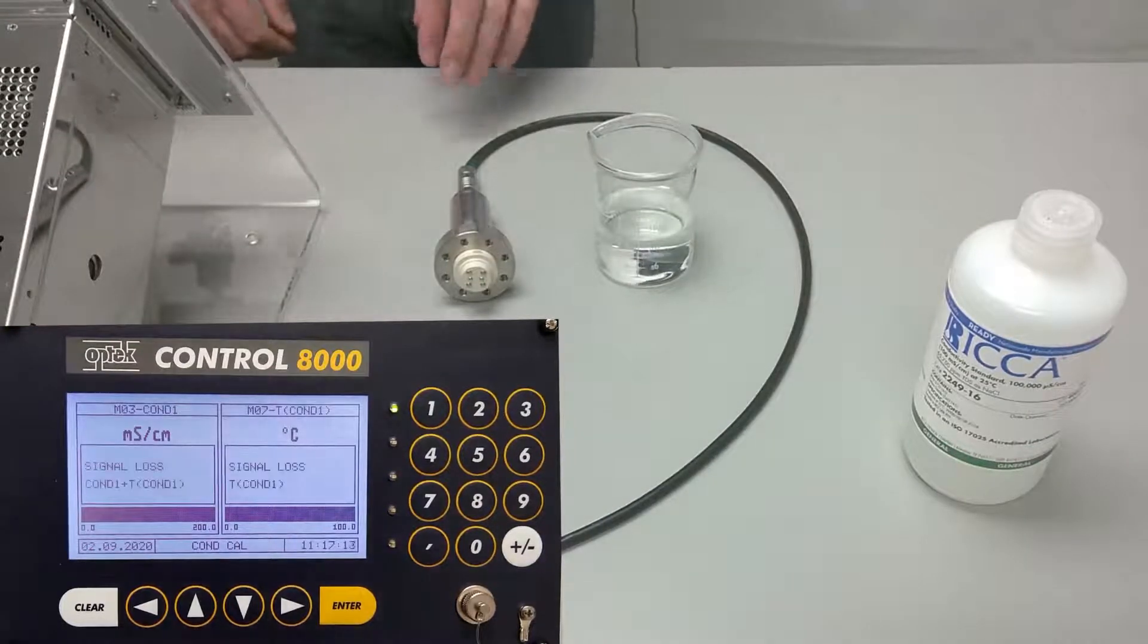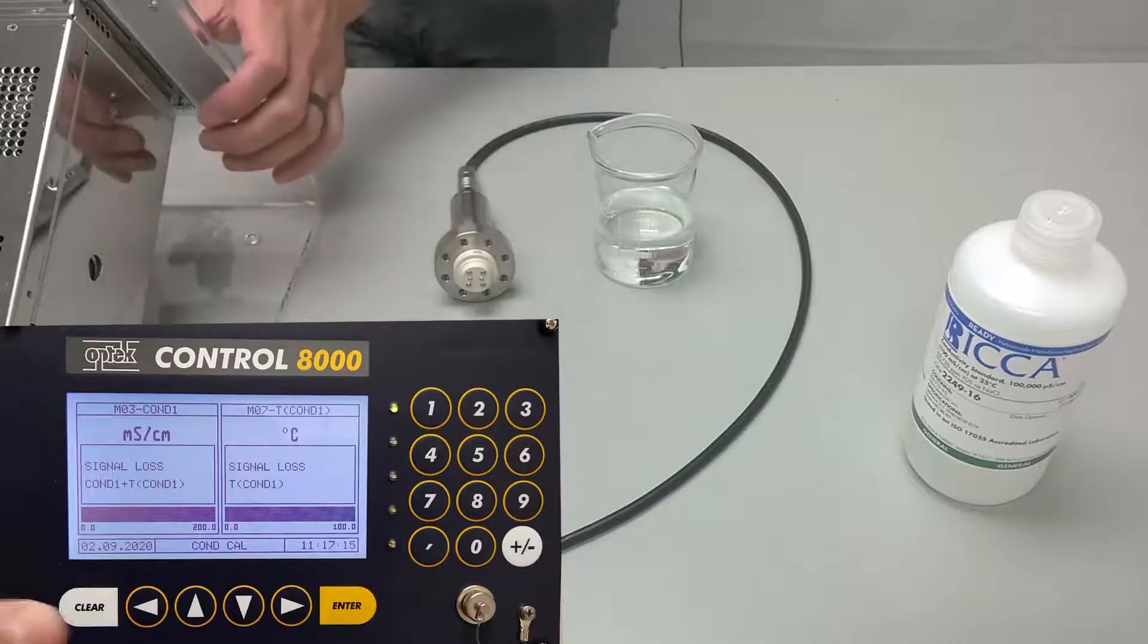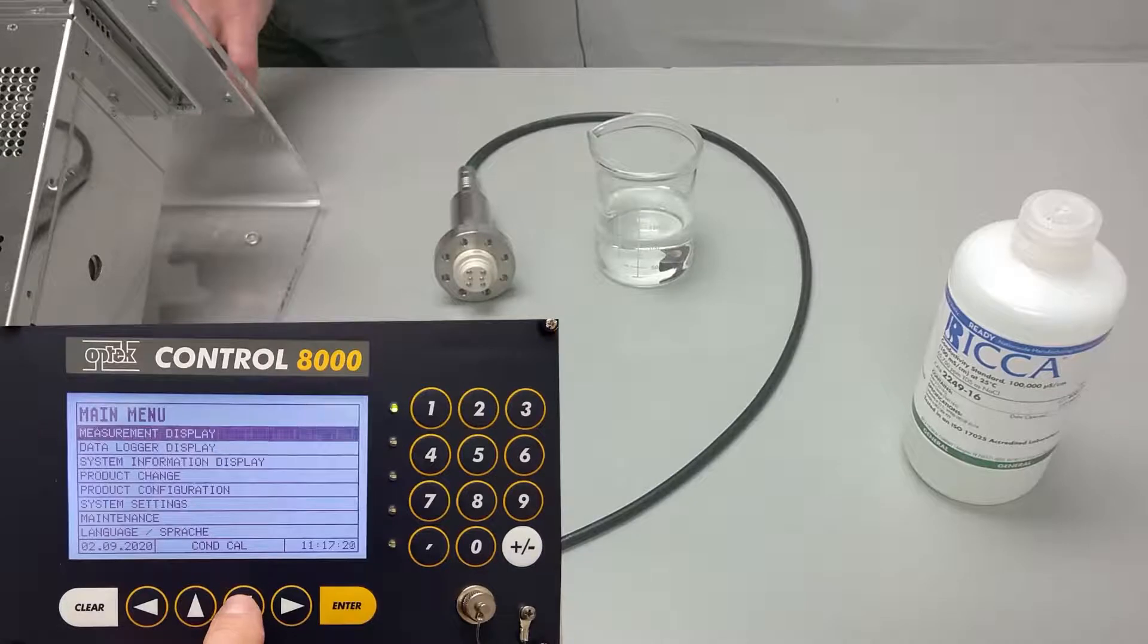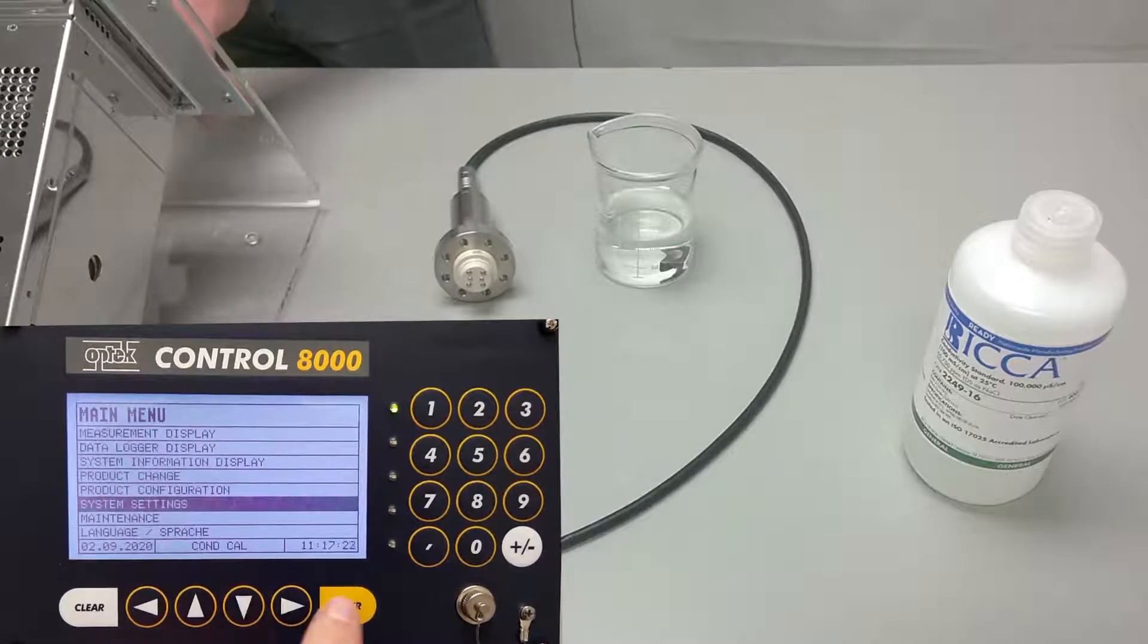The first step is to ensure that the conductivity sensor and temperature RTD probe are set to active. We'll press clear to get to the main menu and scroll down to system settings.